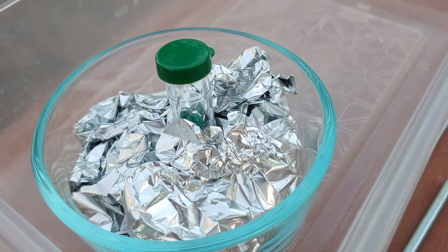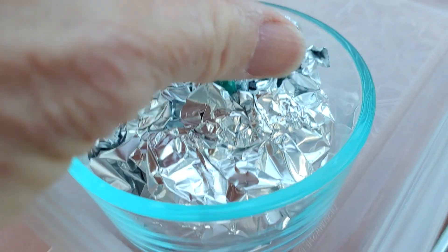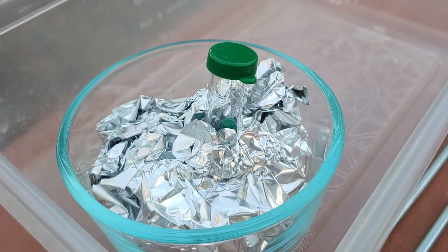I devised this little thing made with foil so that I can have the test tubes set up, since I don't have any test tube holders.